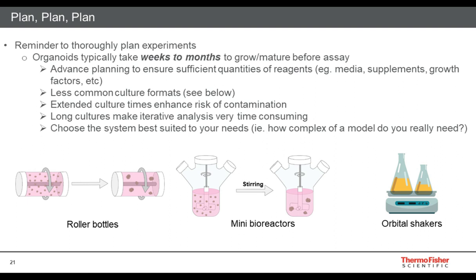And so, although some of this may sound a little bit doom and gloom, it really should not, because these model systems are really interesting and are allowing people to study things in a way they haven't done before. But it is also important to remember to choose the system that's best suited to your needs. And it's important to ask yourself, how complex of a model do you really need? So it may be that in some cases, the traditional 2D model system will still get you to the endpoint where you would like to go.